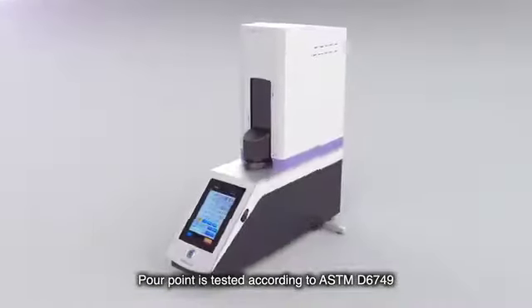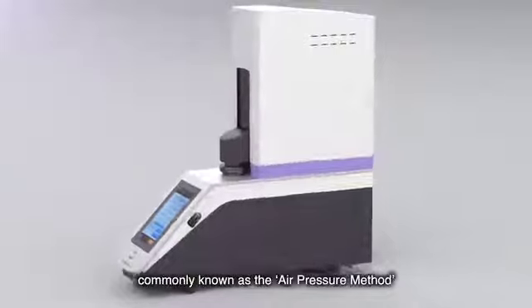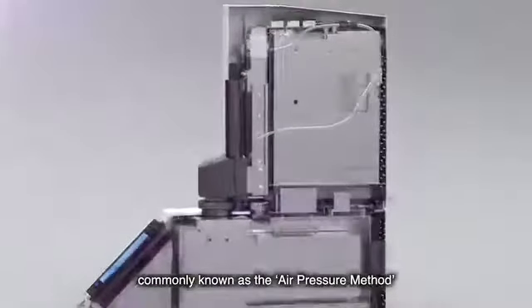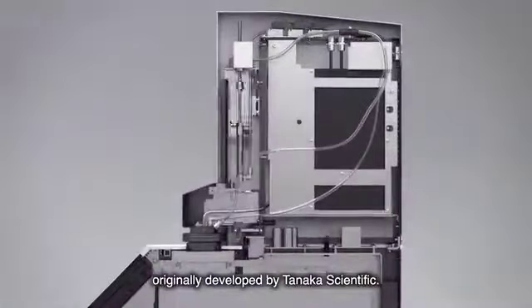Pour point is tested according to ASTM D6749, commonly known as the air pressure method, originally developed by Tanaka Scientific.